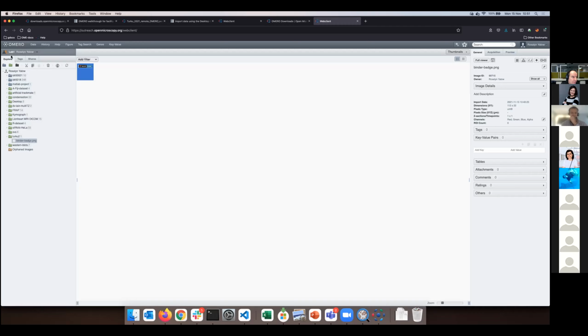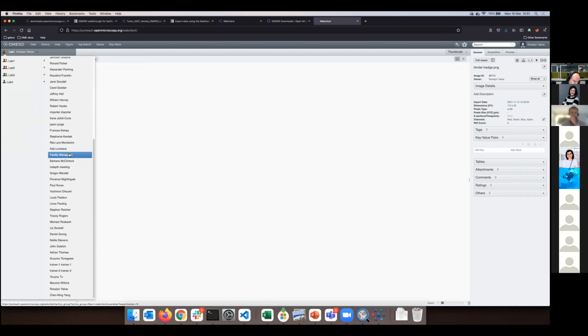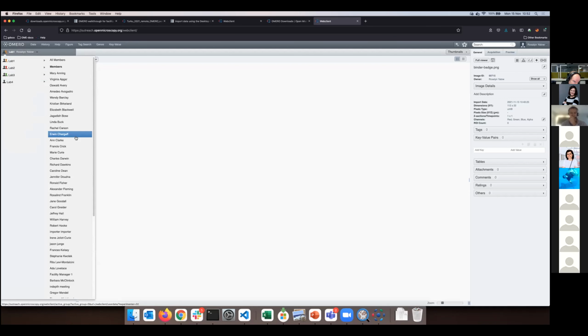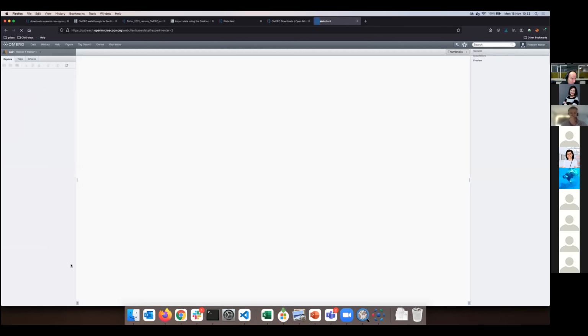Now we are here members of the Lab1 group, which is a read-annotate group, and we can cooperate with each other. I just clicked on the top left and navigated to Lab1, and there is a list of the famous scientists. These are my colleagues. These are my peers in the same group, and these are yourself as well, some of you, majority of you. And nevertheless, I will navigate to data of trainer 1 straight down. So once more, click on the top left, Lab1, drive down and click on trainer 1.